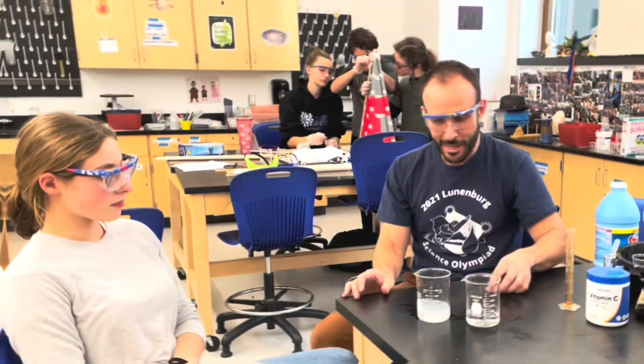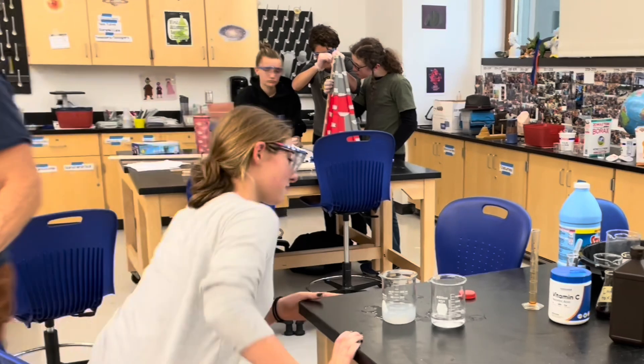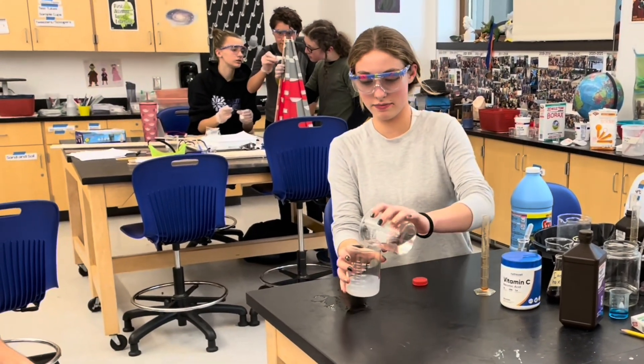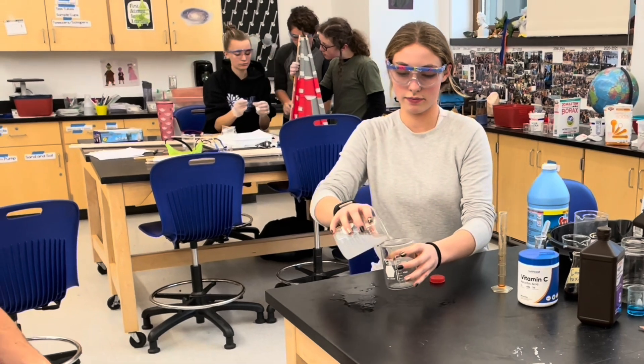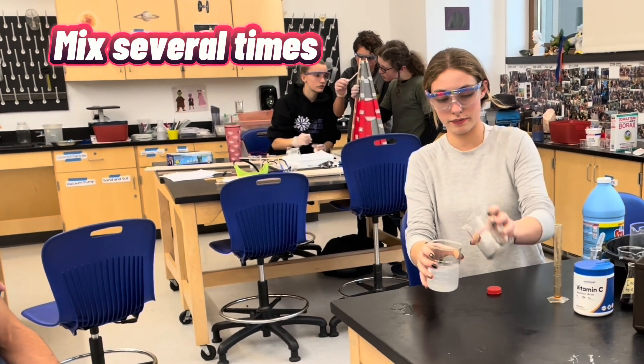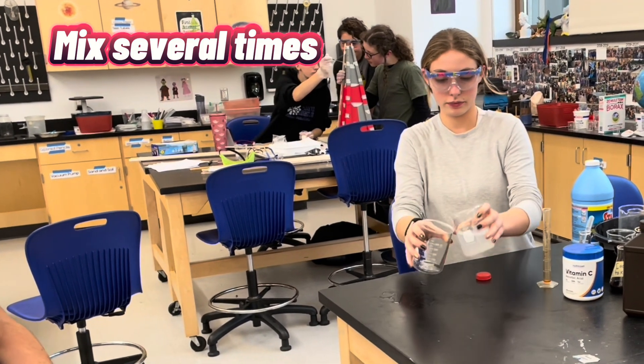So I want you — you can take my seat. You're going to combine them and you're going to stir back and forth. Okay, so stir back and forth. Now hold it up to the camera.